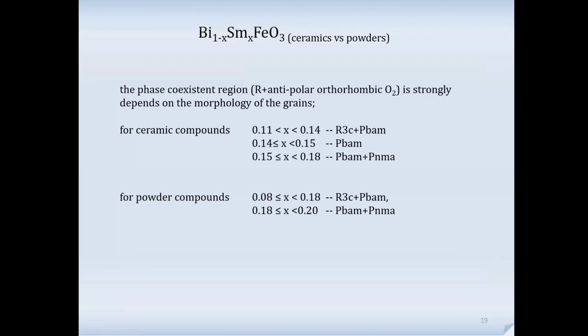And probably this is the answer why we don't see distinct PFM contrast. We cannot clarify precisely the grains and the PFM domains because we always have some mixture of the phases. And again, this mixture is the natural, intrinsic state of the system. When we heat the compound and measure, say, an X-ray pattern, we will see a single phase state. And this is natural for the system.